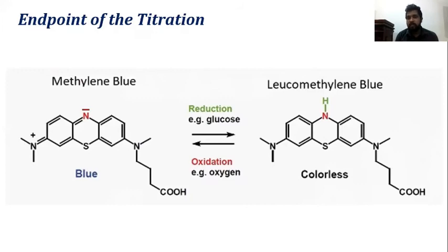In acid-base titrations, the indicator will give a color change depending on the pH range of the solution. But here, it's a kind of redox reaction. Other than that, there are different kinds of titration: potentiometric, electrochemical, and many types. This is also a special type of indicator use.